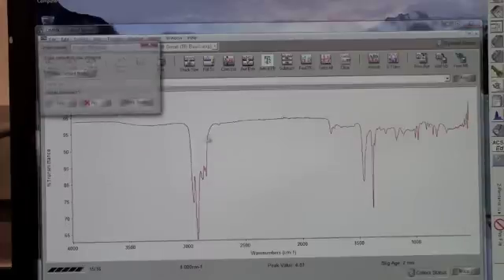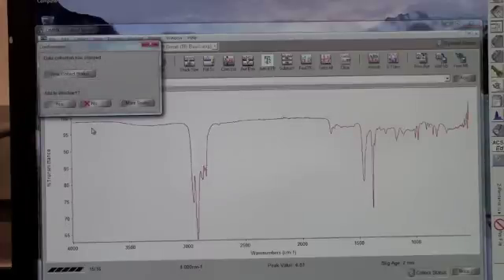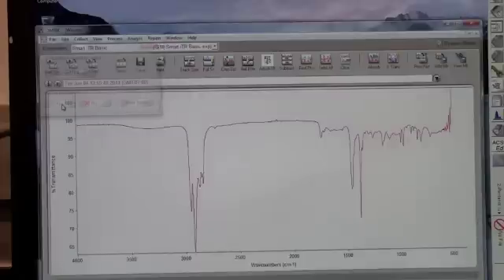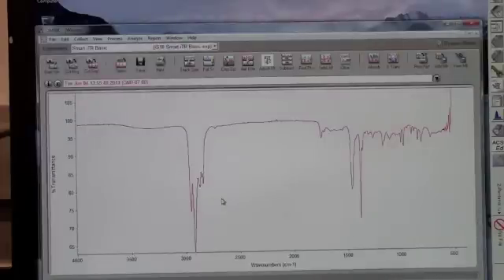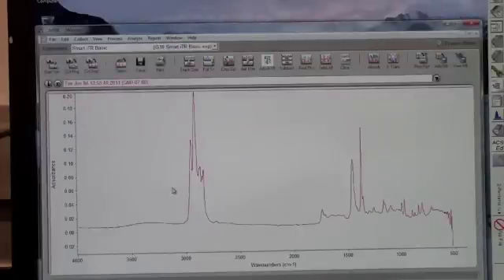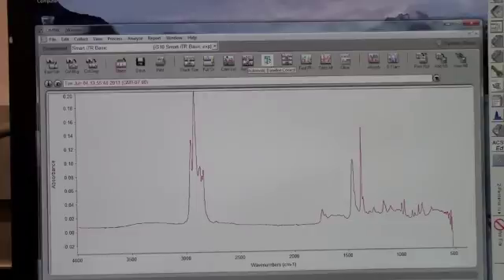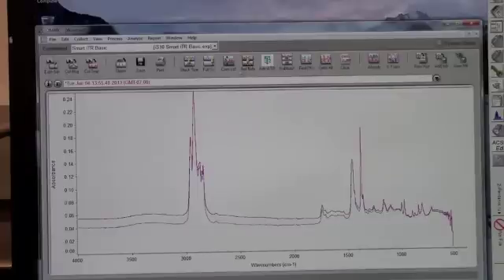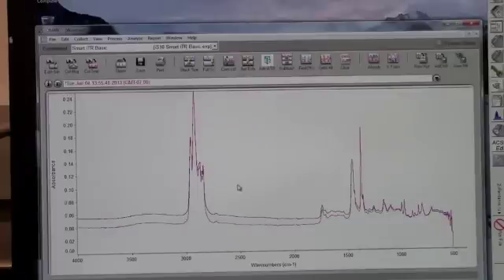After the sample is done running, a dialog box will appear. Click Yes to add to Window 1. Next, you need to baseline the sample. First, click Absorbance, or press Ctrl plus A. Then click Auto Baseline, and then clear the raw data.